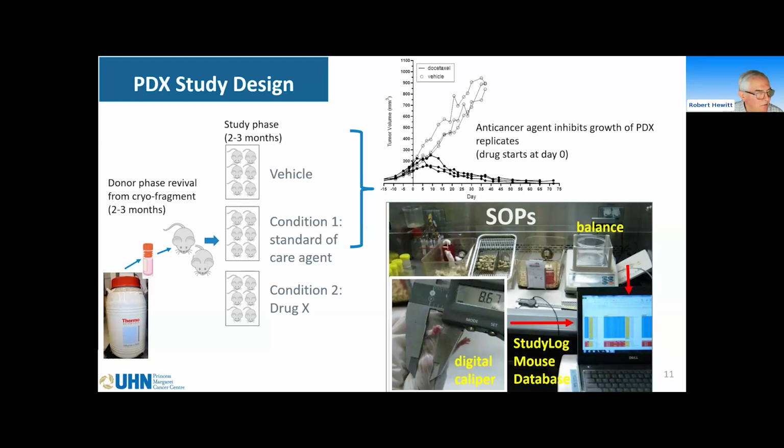Okay. Well, it looks like there are no other questions. Oh, there is one other question. Here we are. What is the recommended maximum cold ischemia time if we intend to work with viable tissue of good quality? How do you handle the freshly excised tissue?